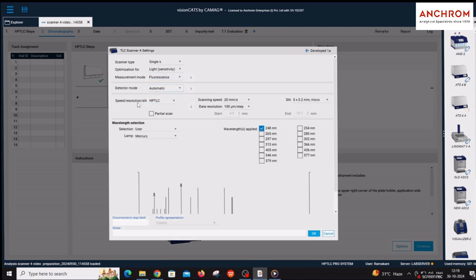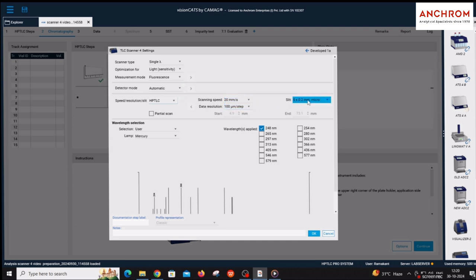Speed, resolution, and slit are by default selected to HPTLC. If modification is done in any of these parameters like scanning speed, data resolution, or slit, it will change to user defined.